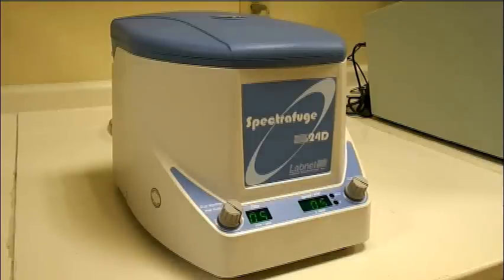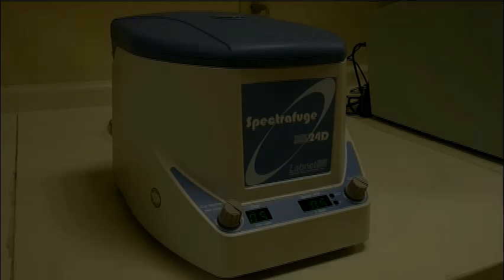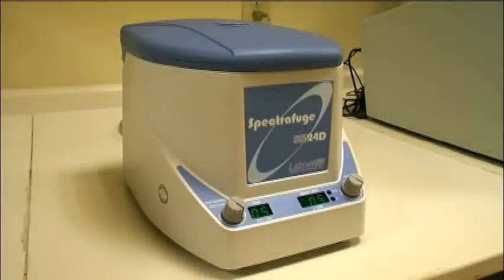Welcome to Tritec Labs, your resource for technical and product overviews of life science instrumentation. Today we're going to be taking a look at LabNet's Spectrafuge 24D Microcentrifuge. It's pretty clear that just by reading the specifications, LabNet's intentions with this instrument are very clear — they wanted to create a versatile centrifuge at a very reasonable price.